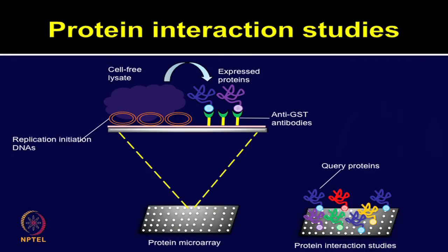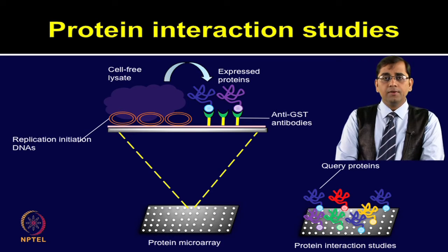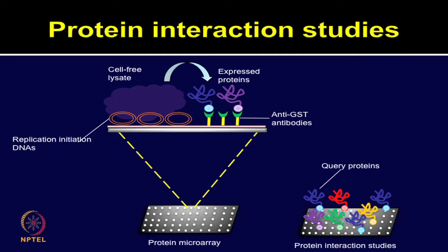The next case study is performed by Ramachandran et al. 2004 to identify novel protein-protein interactions using NAPA microarrays. Authors reported generation of self-assembling microarrays, which was one of the novel technologies reported in Science in 2004.